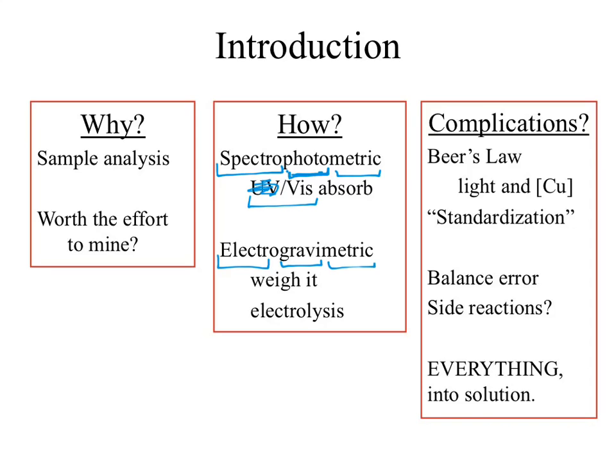Ultimately that goes back to the two things that we've broken it down to already, weighing it and a term that we haven't introduced yet, either in lab or in lecture, electrolysis. We'll run an electrolysis calculation today, and we'll look at a little bit more details on that in lecture and probably later in this lab.